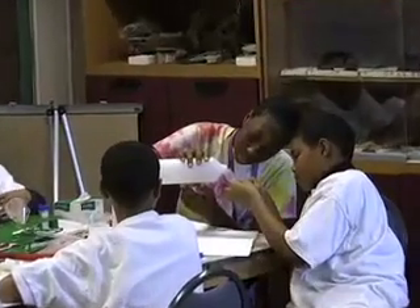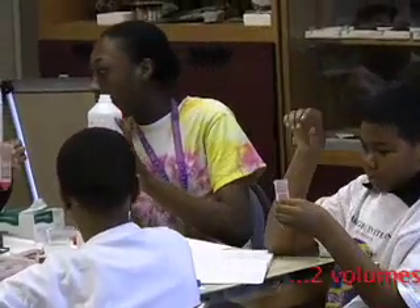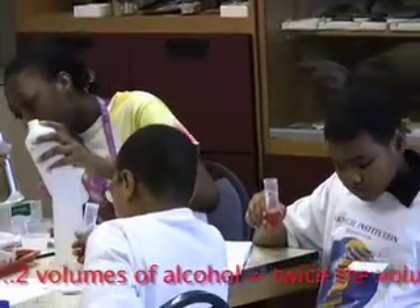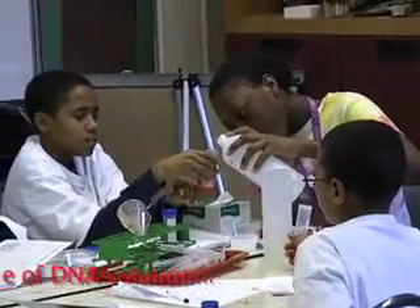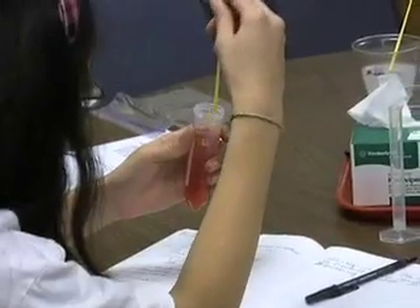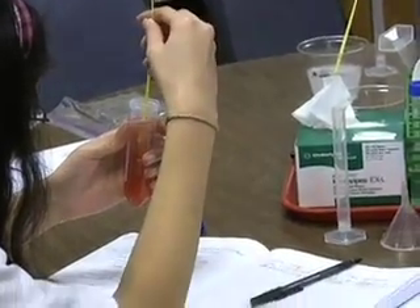We're going to be adding two volumes of alcohol, and that is going to make the solution 70% alcohol. DNA does not like 70% alcohol, so it's going to do something really interesting. You use a yellow loop or a white loop and you start stirring it around, and the DNA will come out of solution.